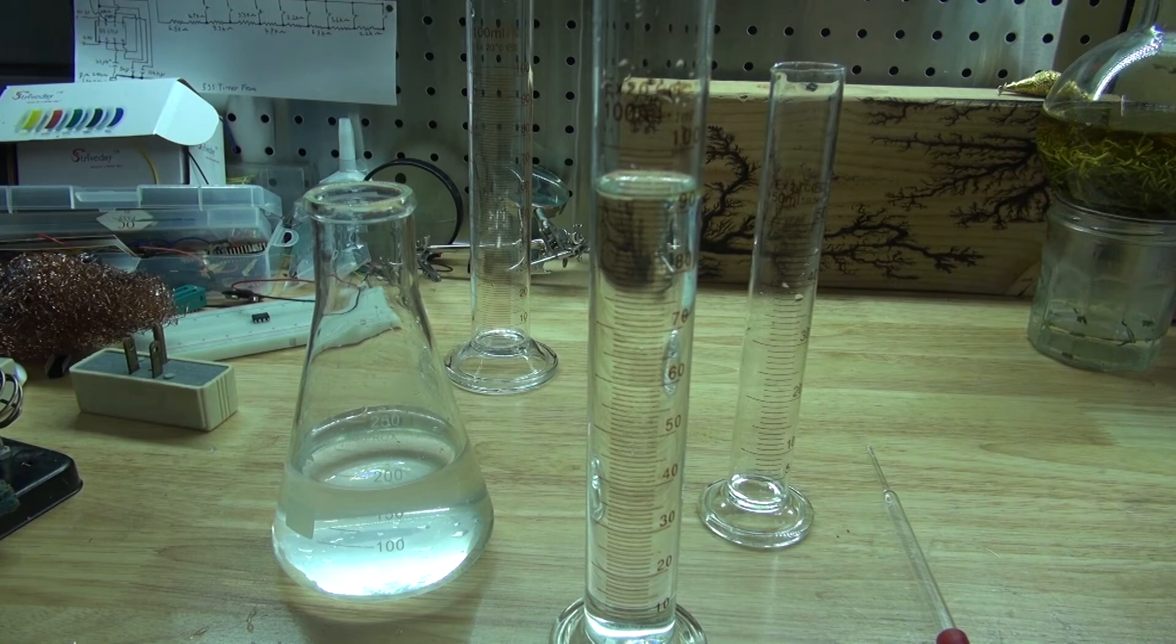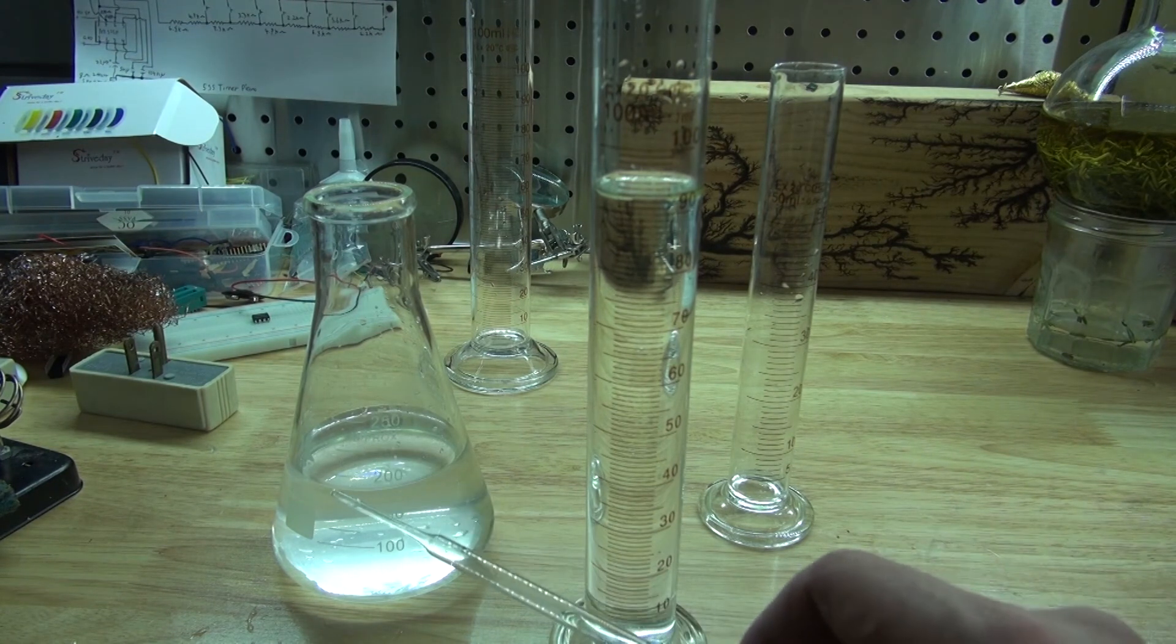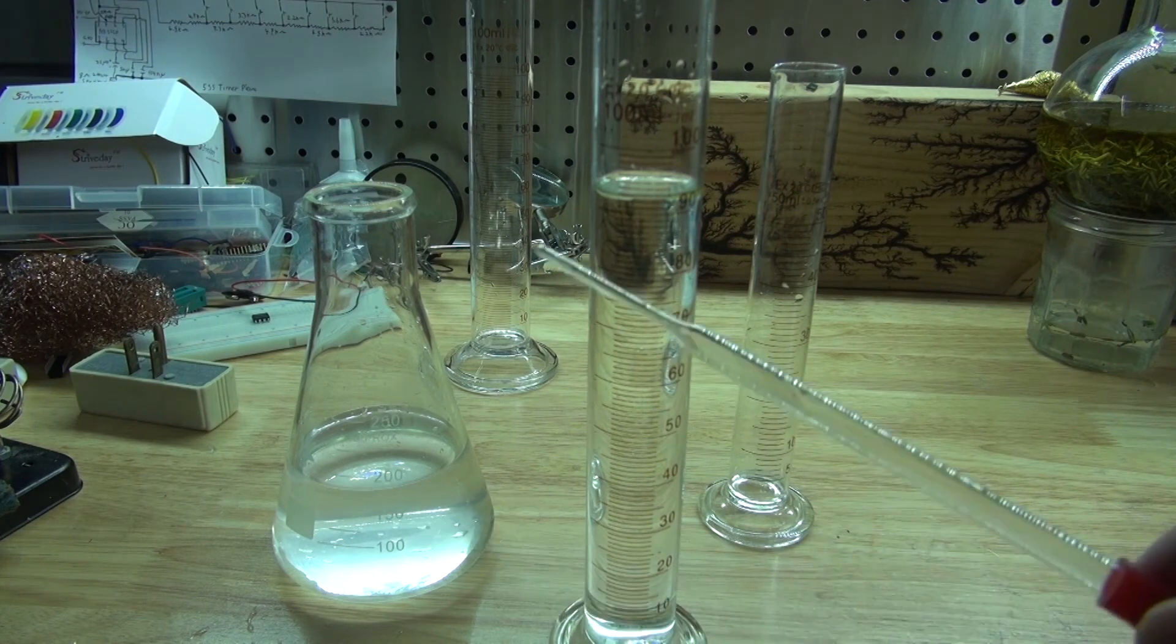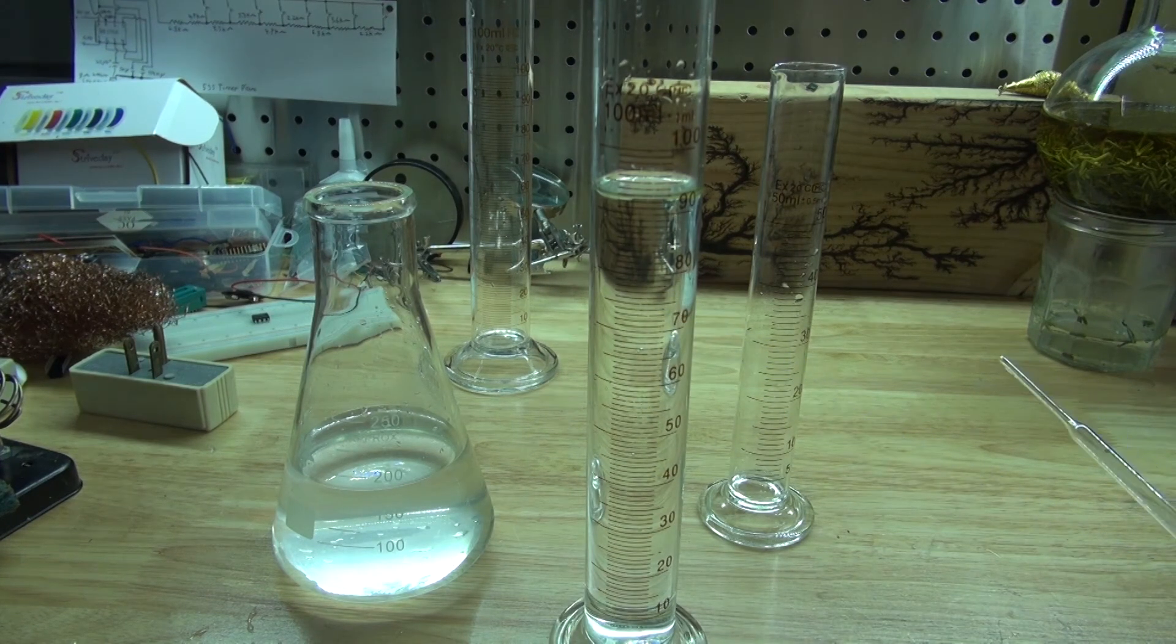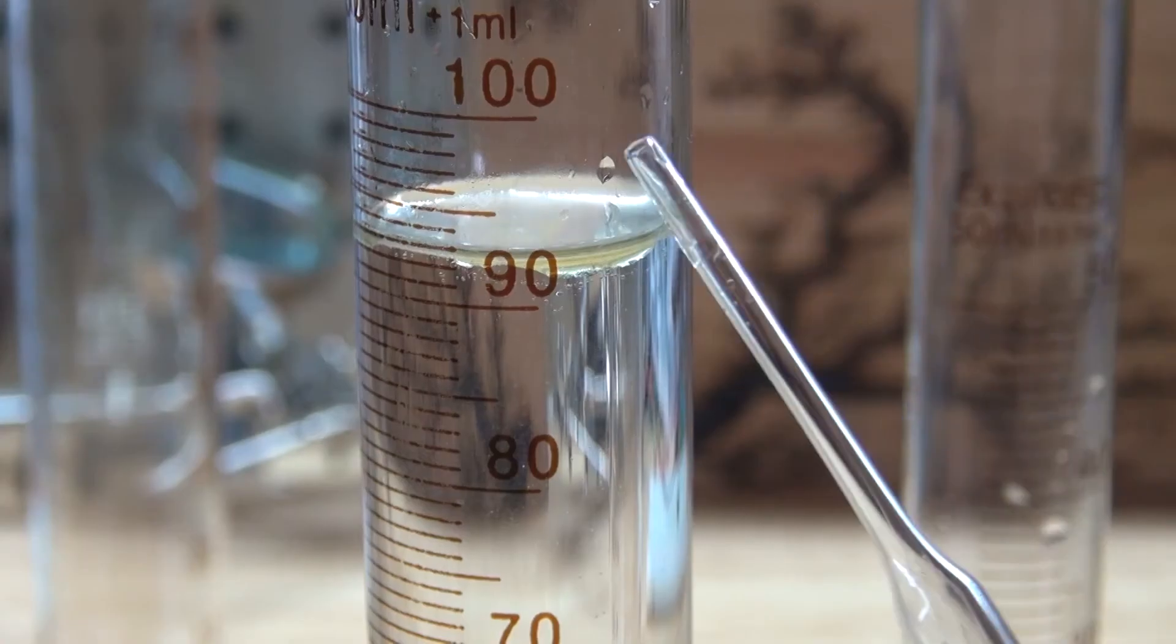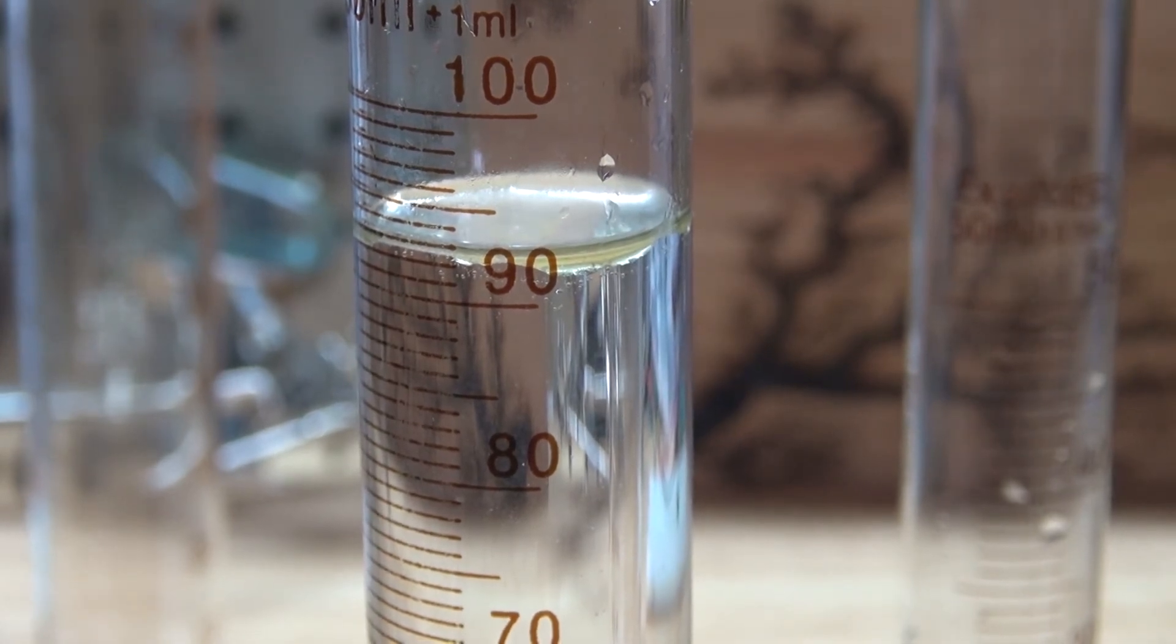As you can see this is what my final result looks like for my second batch. I've collected rosemary hydrosol in the Erlenmeyer flask and in the volumetric cylinder, some rosemary hydrosol and rosemary essential oil floating on the top. As you can see I've collected close to one milliliter of rosemary essential oil.